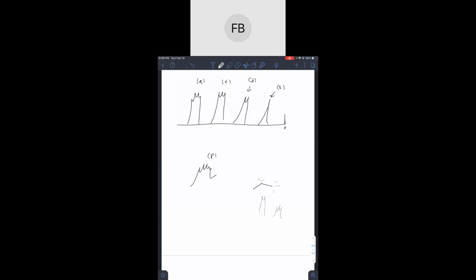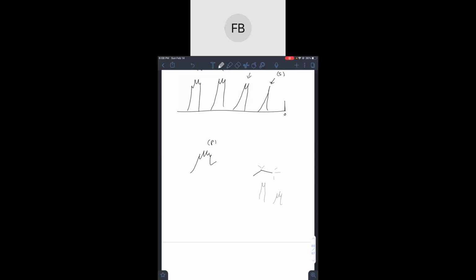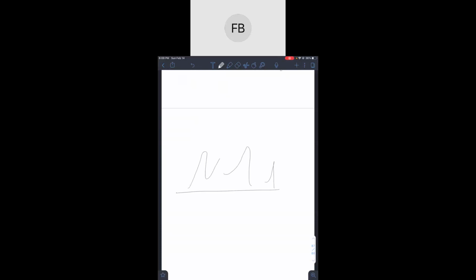All right. So let me just back up a little bit. How will an NMR question work? Generally, he'll give you a graph, and there's an x-axis, and a whole bunch of things happening. And then he'll say, oh, this is C6H12O, or C6H10Br, whatever.